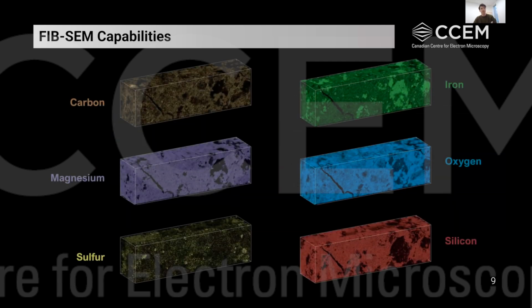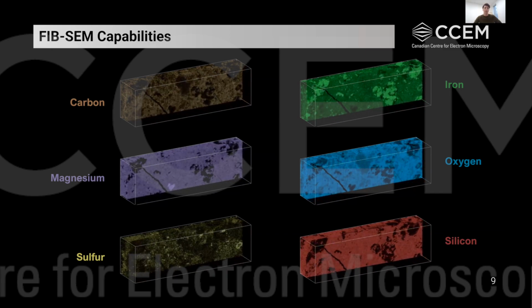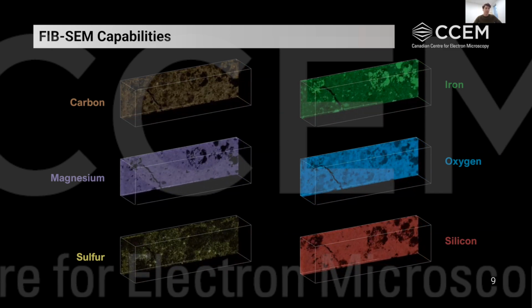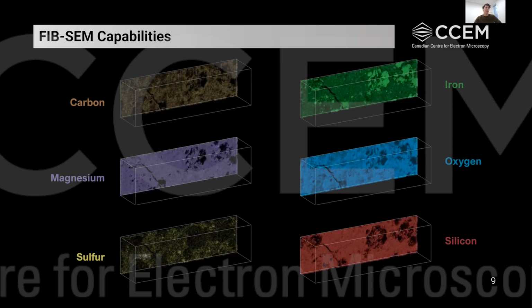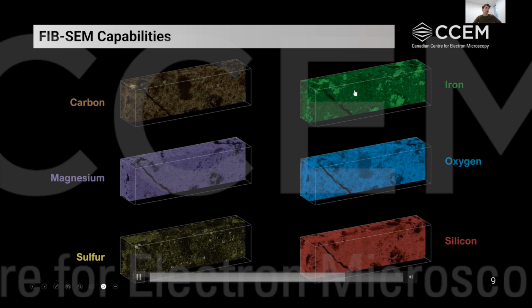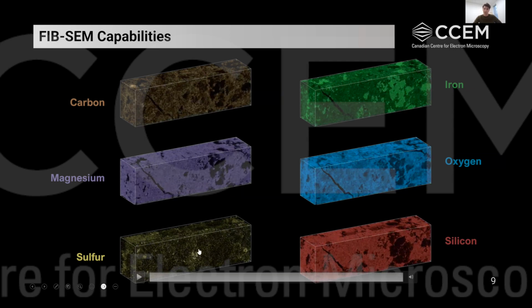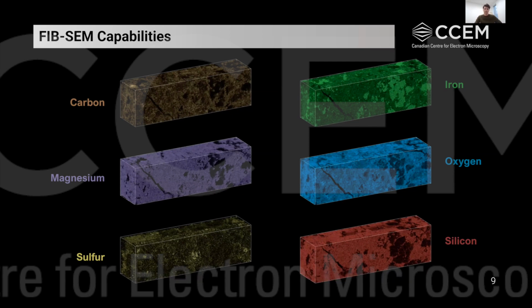And as well, for this particular run, we've actually been able to couple this with 3D EDX. So we're actually able to get spatial maps of chemical composition throughout the structure of that geological sample. We can look at where iron is preferentially located. We can look at where carbon is deficient. We can look at sulfides in the 3D volume, all with excellent spatial resolution.